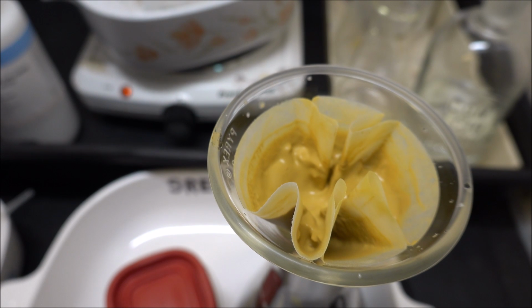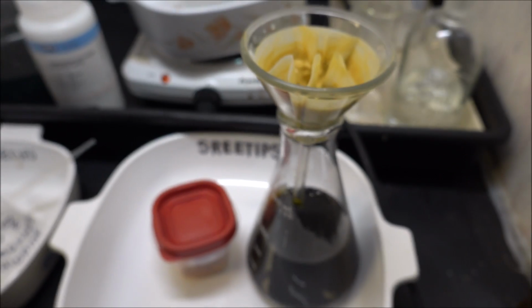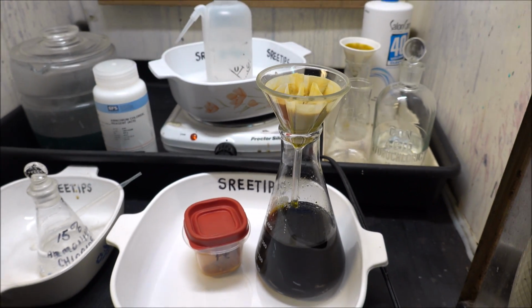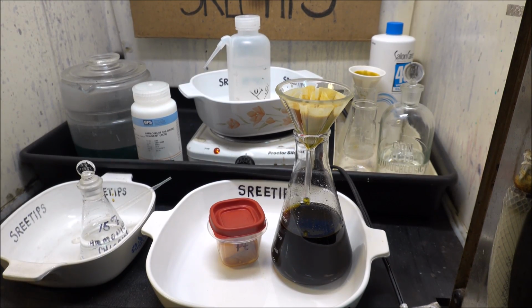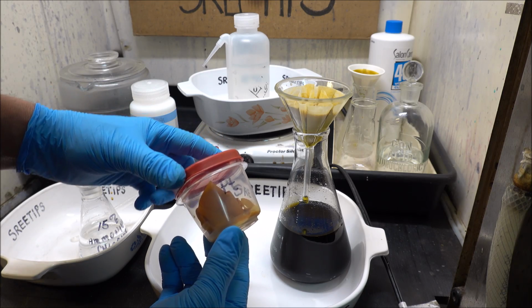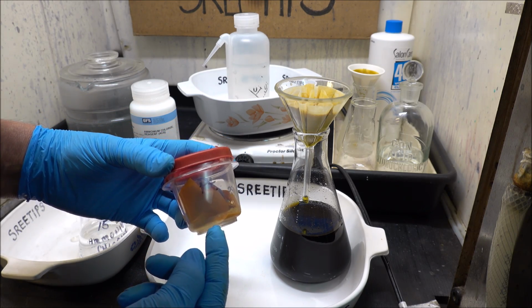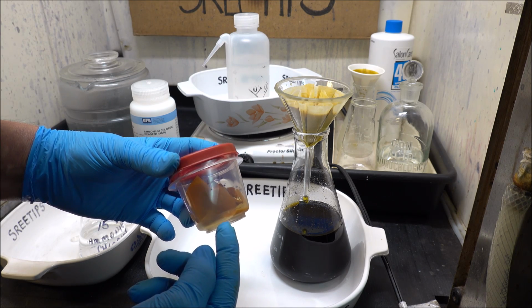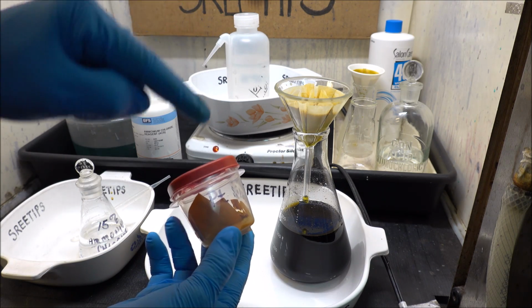Here's our platinum salt, all filtered out of the solution. What I'm going to do now is transfer that funnel with the platinum salt into this little container. Somebody was asking about this container recently. It has platinum salt in it from previous videos. And what I'm going to do is I'm going to add this to this.